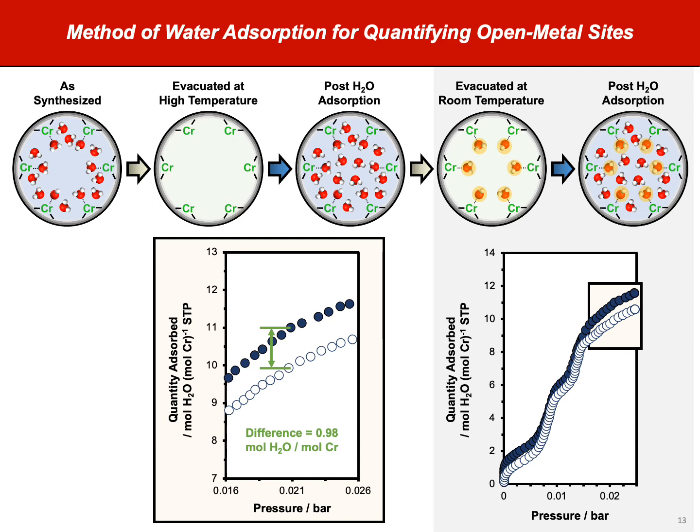I won't go into the reasons why you specifically have to look at the region past the second capillary condensation step, but I'm happy to discuss that further if you have any questions that you would like to point at me.